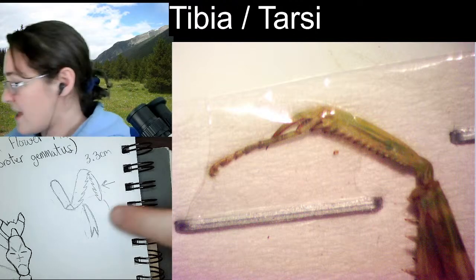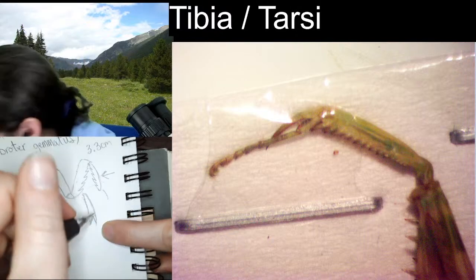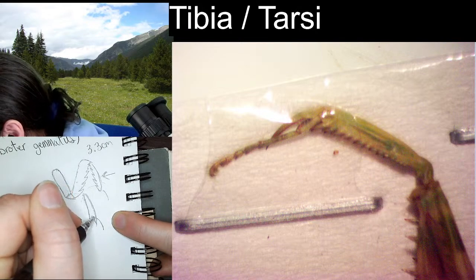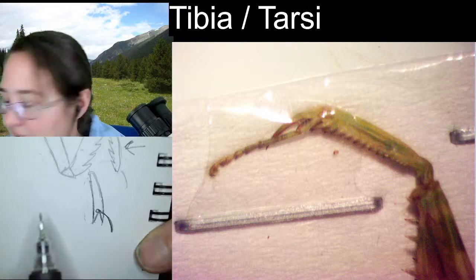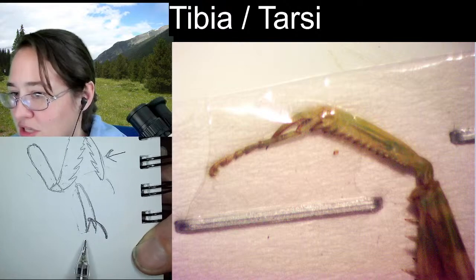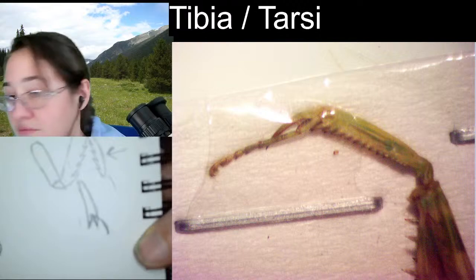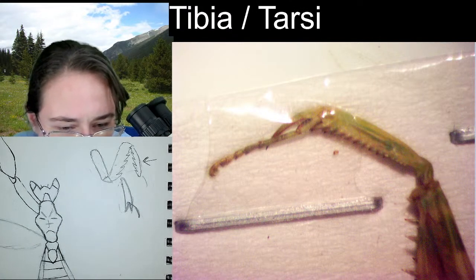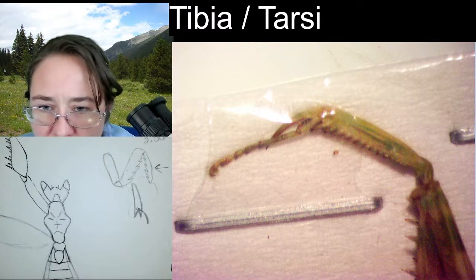All right, and then the tarsal segments, they don't come out from either of these tips. The tarsal segment actually comes out from the base of that V here. They come out right around here. And so that's why sometimes, from the side, the tarsal segments look like they're coming out not from the end of the tibia, but from somewhere in the middle. It's because they are coming out from this V here. It looks like there are two rows, and the shorter ones might look longer if flipped over.